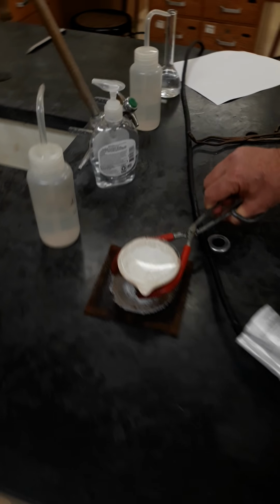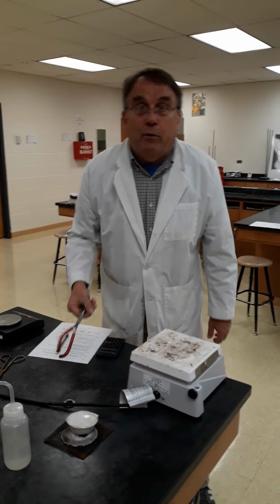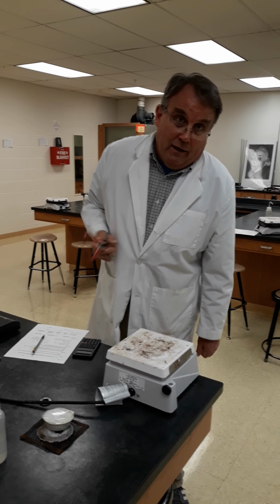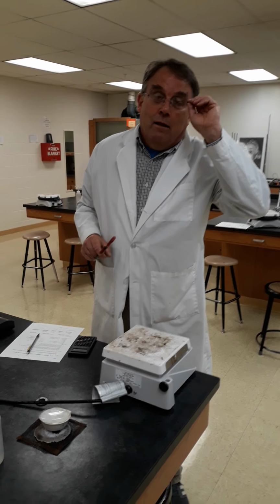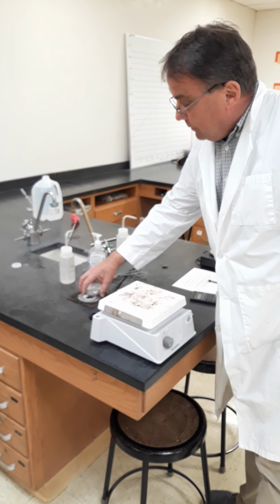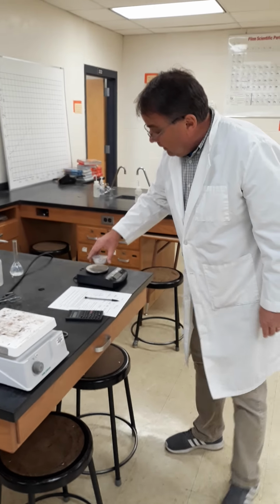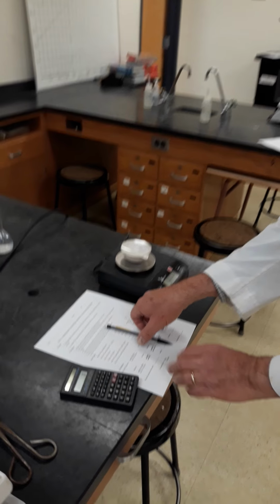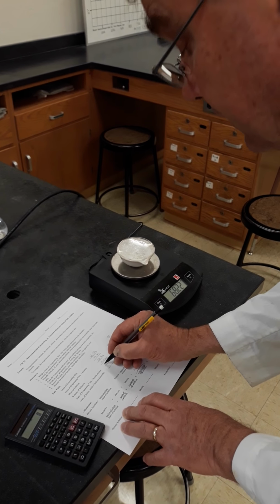While it's cooling, we can pause it and you can talk with your neighbor about why we have to weigh cool glassware and not hot glassware. Okay, so it is now cool enough to weigh. Put your hand close, see if you can feel the radiant heat, then pick it up. Yep, cool enough to weigh. Put it on the scale. 68.22.